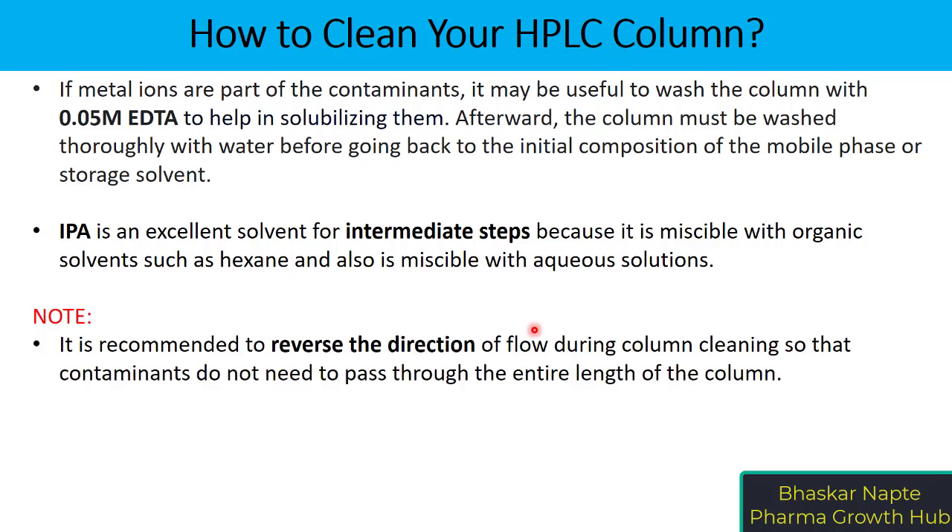It is recommended to reverse the direction of flow during column cleaning so that contaminants do not need to pass through the entire length of the column. Column contamination is typically present only on the inlet frit. So when you pass flow from the outlet side, the contaminants at the inlet tip are removed over a shorter distance and do not travel across the entire column length.